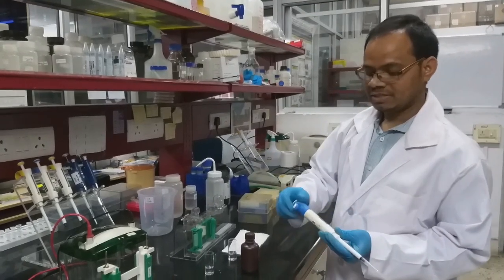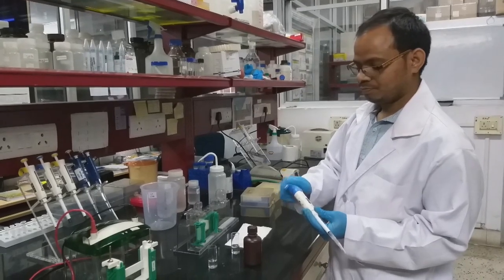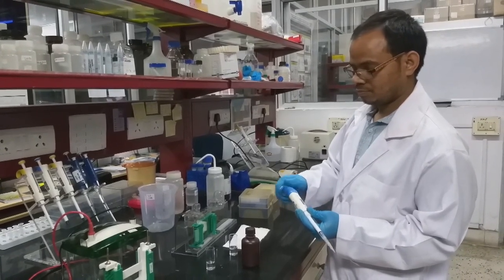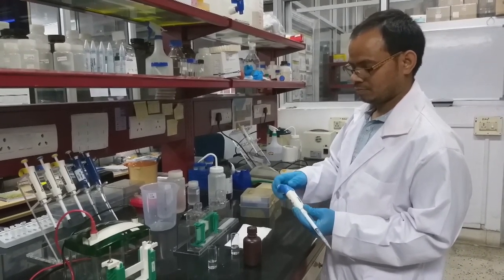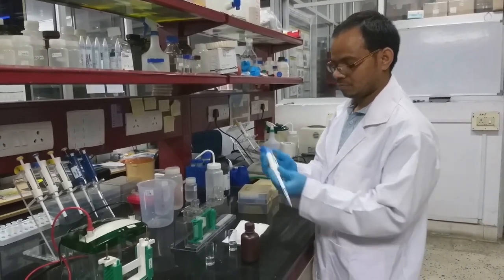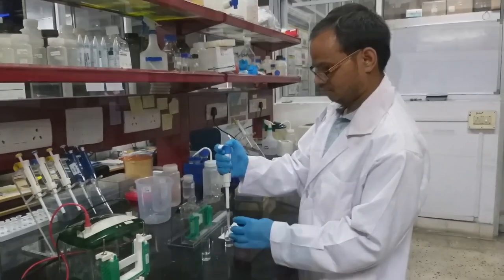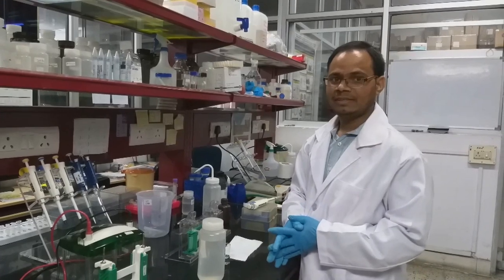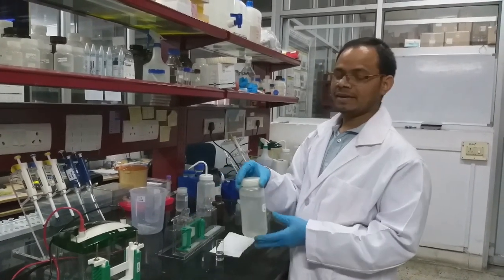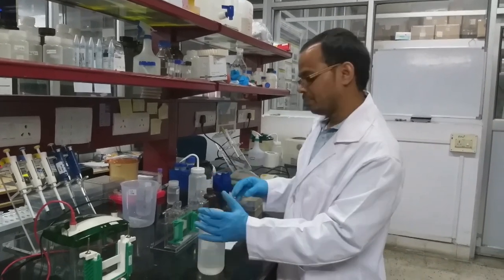So I have to adjust 300 microliter. The next component is 1.5 molar Tris pH 8.8. We have to add 2.5 ml.